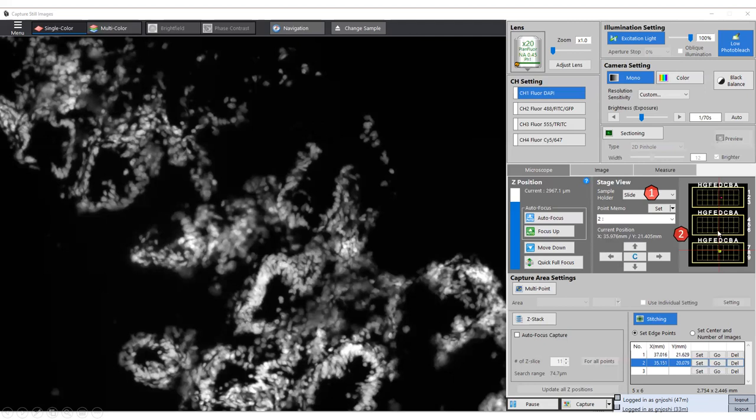Second is click on the regions anywhere so that I get my sample kind of in focus in X, Y direction, right? Because let's say if I'm using a slide and my sample is right here somewhere, I can go and click on that. And the objective is sort of in the right orientation to where the sample is. So use this area, click anywhere. It works fantastic. You can also move your sample once you are close to it by clicking these arrow buttons or simply by dragging on the screen, okay?